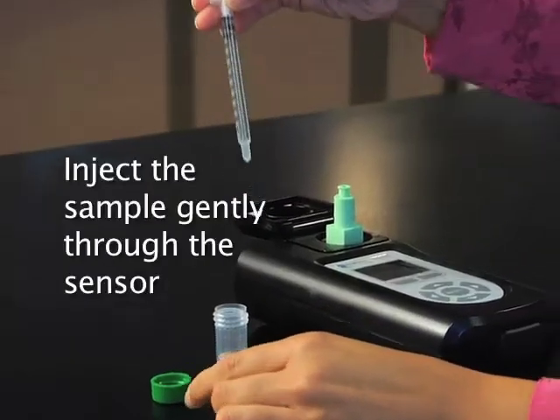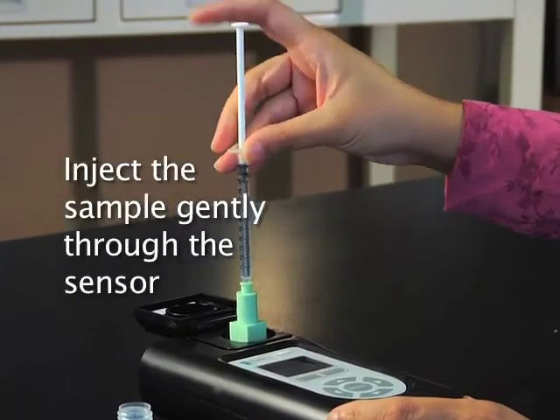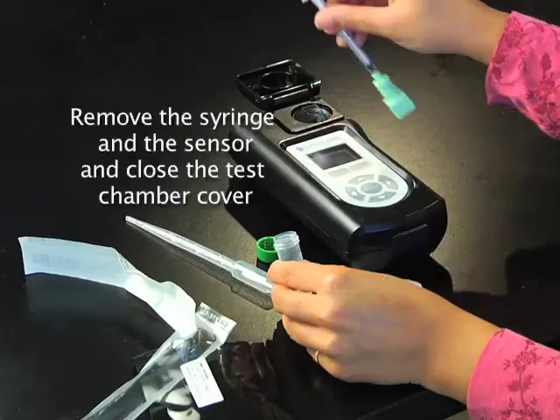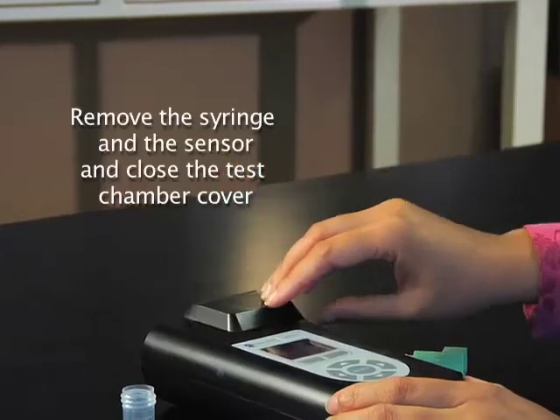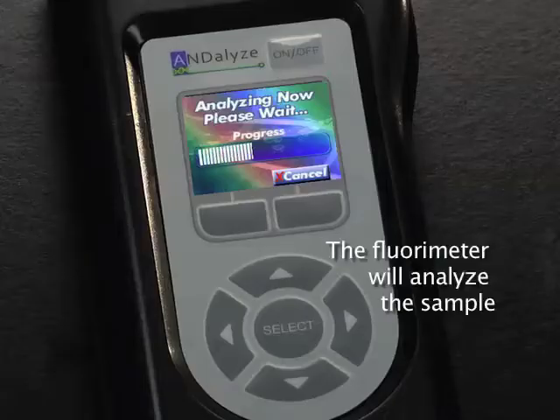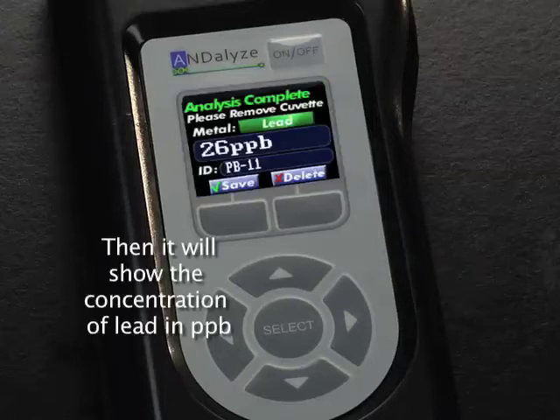Inject the sample into the sensor, emptying the syringe. Remove the syringe and sensor and close the test chamber cover. Press the Start button on the keypad. The fluorometer will analyze the sample and then show the concentration of lead in parts per billion.